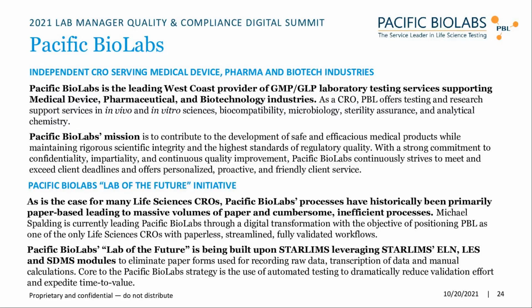And of course, we're building our solution. The cornerstone of the solution will be the STARLIMS system, and we are leveraging their electronic laboratory notebook, LES, the lab execution system, which is a new module that will take the place of the paper laboratory worksheets that we use in our processes. And SDMS is for the capturing of test data from the instruments.